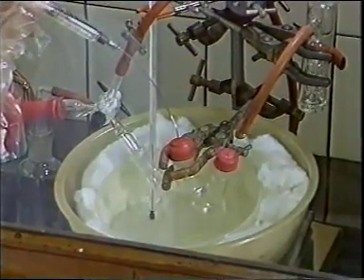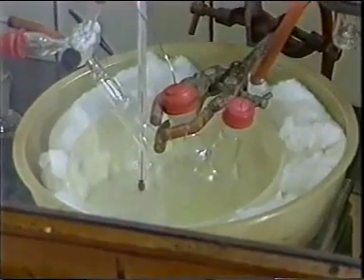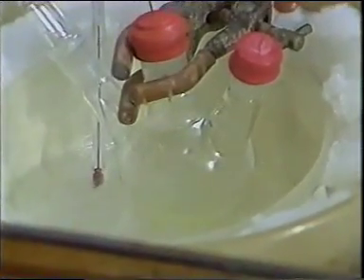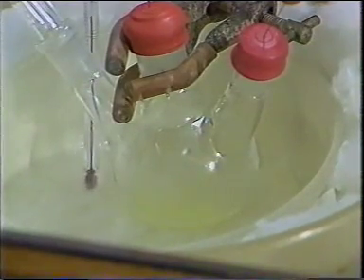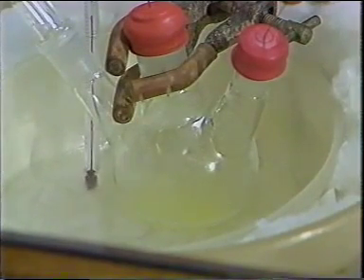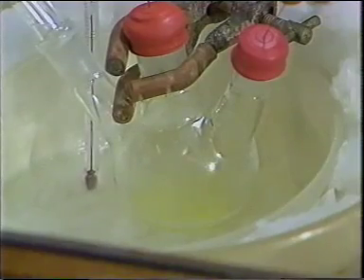The first persistent appearance of the yellow color indicates that all the monoanion has been formed. And I then need to add just twice as much.